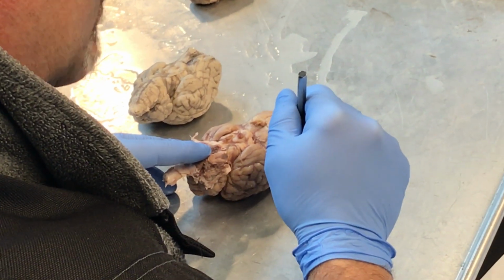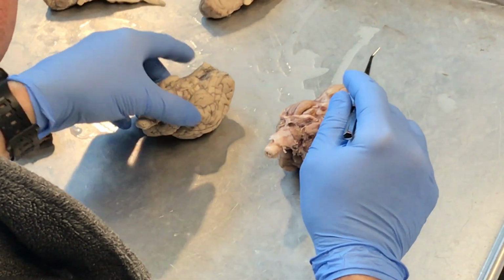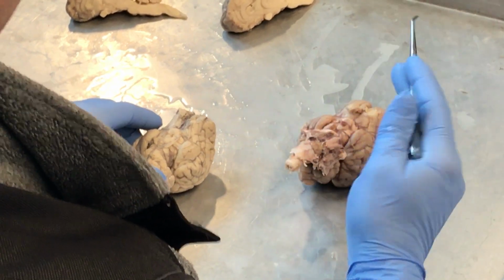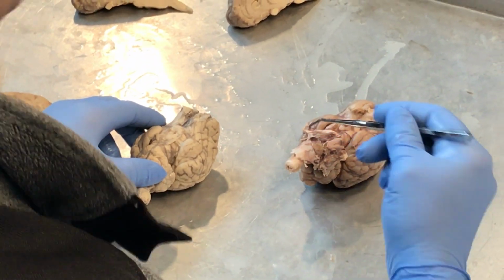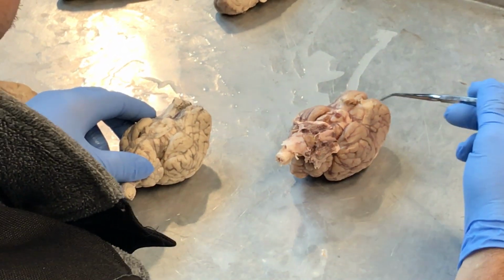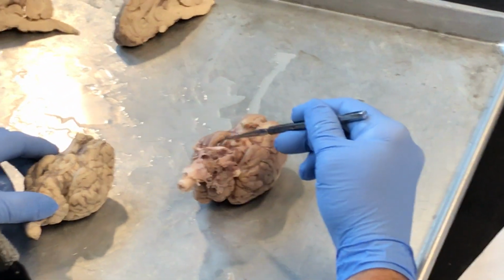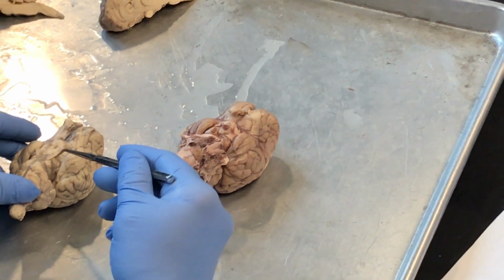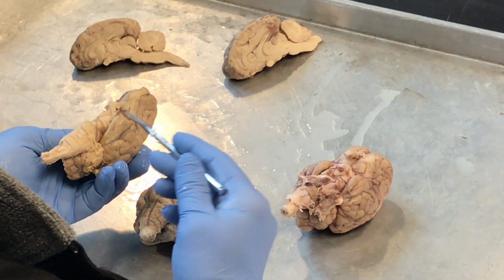Now we'll go to the ventricles a little bit later on. Cerebral peduncle. That's kind of a funny name, isn't it? The cerebral peduncle is the way I like to do this. TAs have heard me say this. It's like broccoli or cauliflower. You've got the floret at the top, which is the round thing, and at the bottom is the stalk. So this is the floret, the head of the broccoli. And then the stalk is this area right here that comes down. So the cerebral peduncle is this area here and here. It's also this area here and here, okay? And then this area here, you can't see the other side.